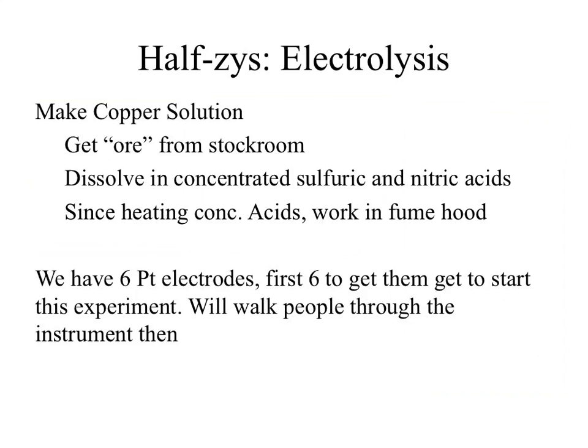Which adds another level of hazards to this. Not only are you working with concentrated nitric and sulfuric acids, but now you're working with really hot concentrated nitric and sulfuric acids. Okay? The other issue that you'll find with this is that when you heat these two acids, they do react with each other to generate a noxious fume, some nitrogen oxide compound, which is very, very toxic, and we don't want to breathe that in.